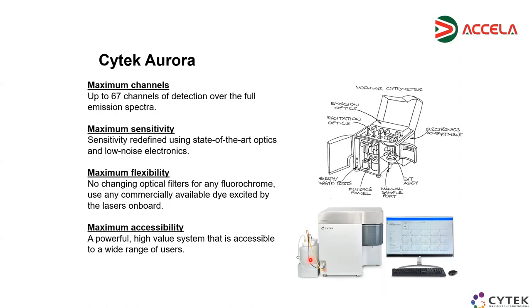I saw this panel that you showed with quite a few markers, which also show some kind of continuous expression. And if I see this correctly, you have a better resolution of positive or negative distinction than conventional flow cytometry. Is this correct? So you have quite a good resolution. Yeah, the resolution and separation, because we collect all photons and we are using these really small filters that are separating overlapping dyes better. Yes, this is true. And did you, in these experiments, find using those fluorescent minus one controls necessary for some markers, or what is your experience with that?